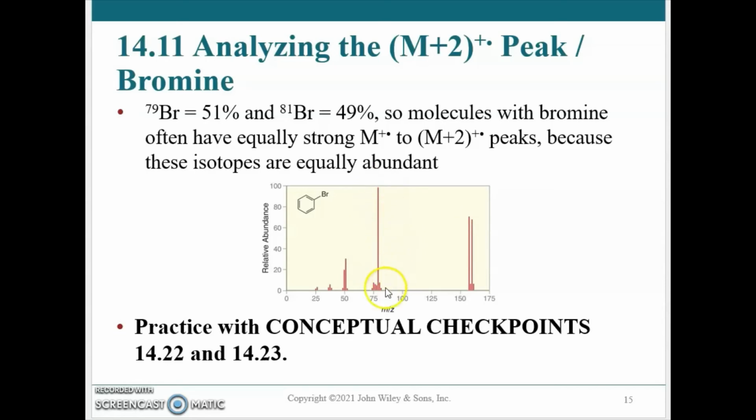The ion that's responsible for the base peak does not contain bromine, because there is no bromine isotope pattern for this peak. In this case, this also is not the bromine isotope pattern. The spacing is only 1 mass unit, not 2 mass units. So this is also not from the bromine isotope pattern.